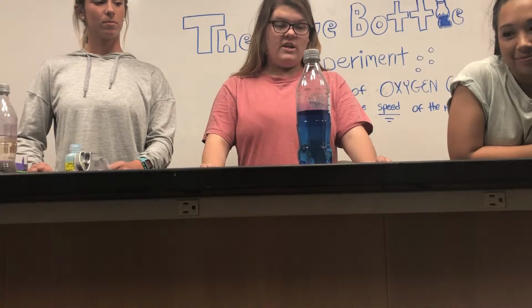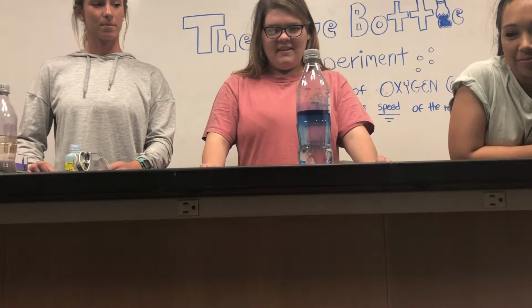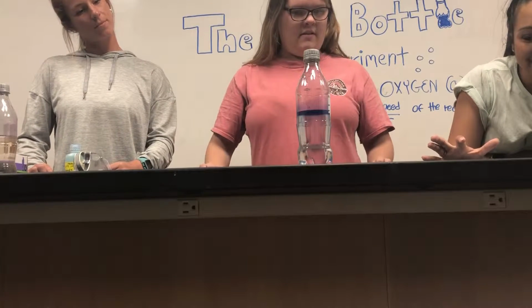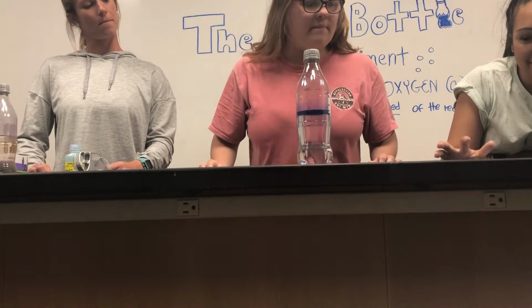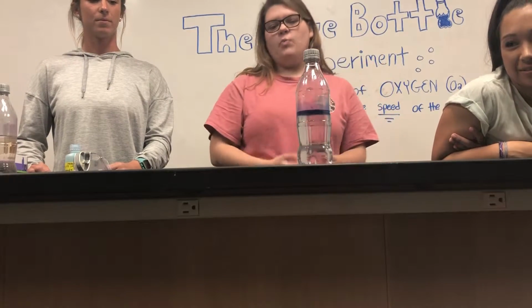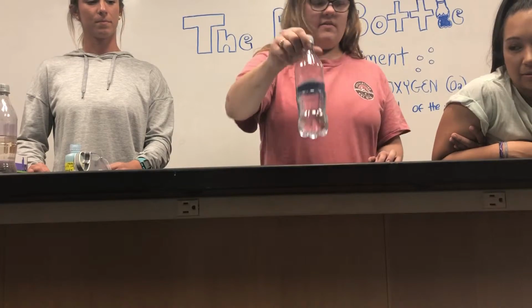Actually a little longer than 30 seconds. Oh, there it goes. A little bit longer. All right, we get it. And that was about 40 seconds. And it's still a little blue at the top, but for the most part it's clear. So that took about 40 seconds.